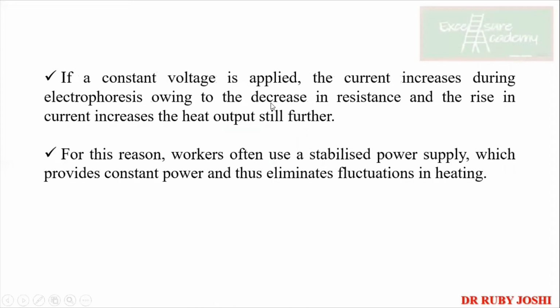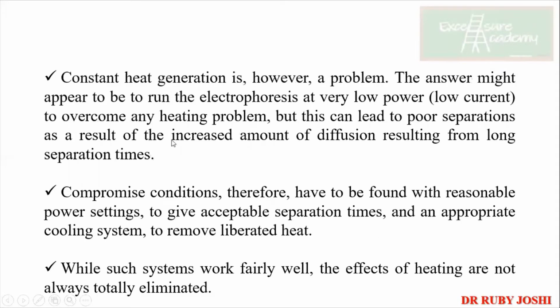Yes, ma'am. So if a constant voltage is applied, the current increases during electrophoresis owing to the decrease in resistance, and the rise in current increases the heat output still further. So for this reason, we don't want to have the fluctuations in heating, इसलिए हम एक constant power supply use करते हैं, ठीक है? So that was all about the heat generation का problem and everything.